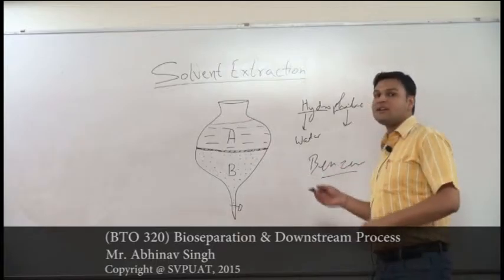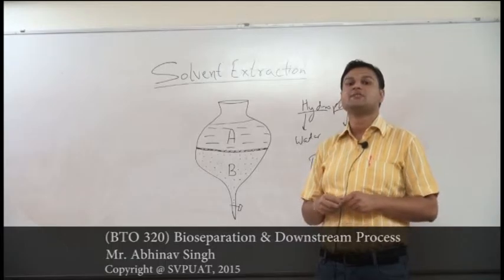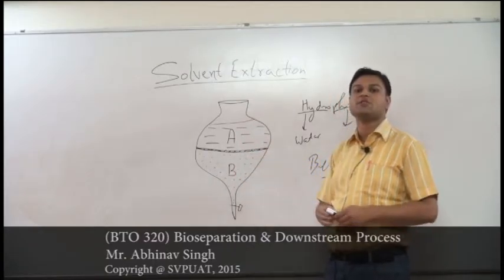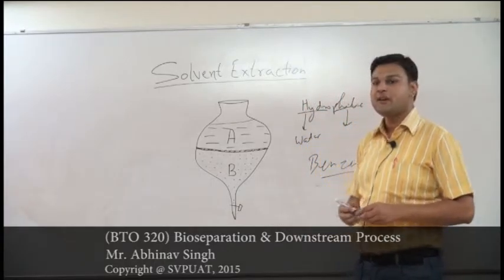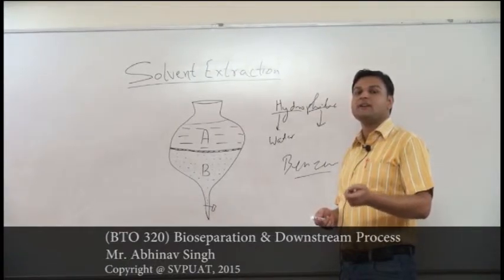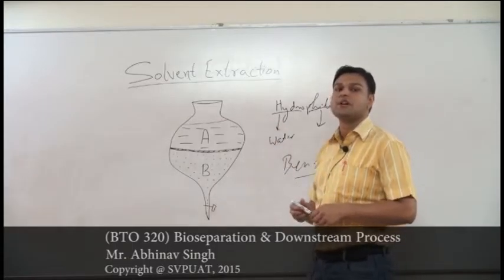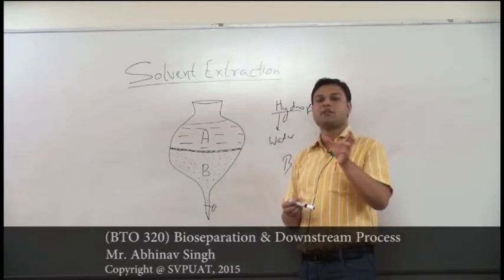So, utilizing this particular principle, we have a purification technique, that is solvent extraction. As given in this diagram, we have two types of solution, solution A and solution B. One of them is hydrophilic and the other one is hydrophobic. You can consider the example where we mix water and some kind of oil. We have mixed it together, shaken the flask very well, and we will allow it to stand for some period of time. So what will happen after that period of time?